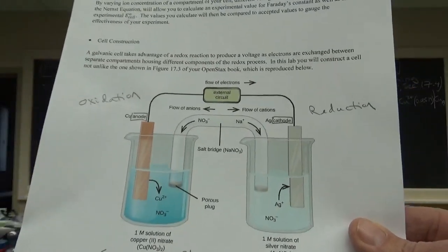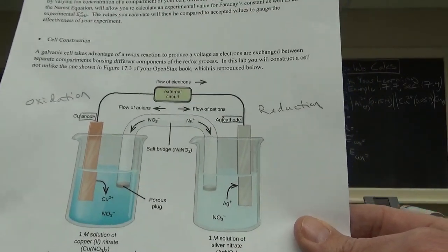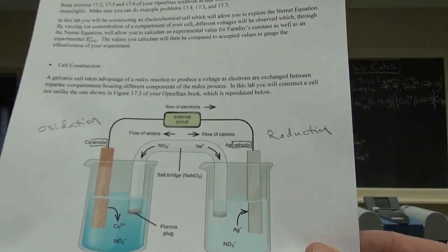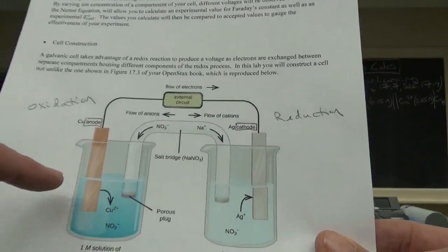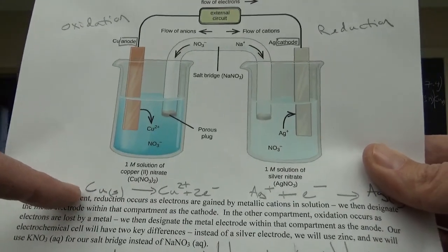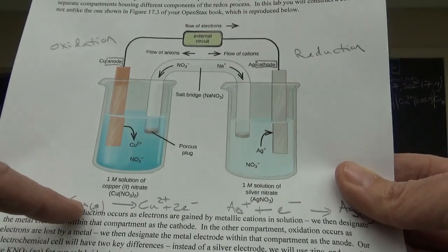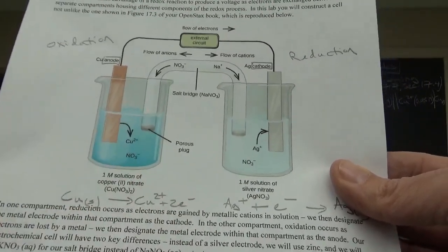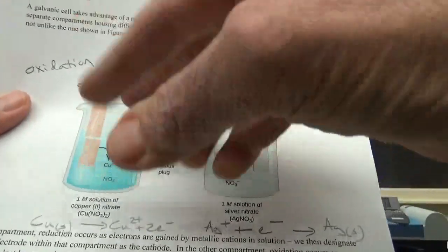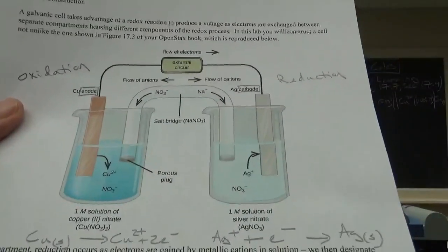You might remember the acronym OIL RIG. Oxidation is a loss of electrons, reduction is a gain, or LEO GER. Loss of electrons is oxidation, gain of electrons is reduction. So what's happening over here is shown schematically, and you might remember it more just showing an oxidation half reaction. So copper with no charge going to copper plus 2 charge plus 2 electrons. That's oxidation. On the other side, so actually this copper anode is degrading or decreasing in mass over time.